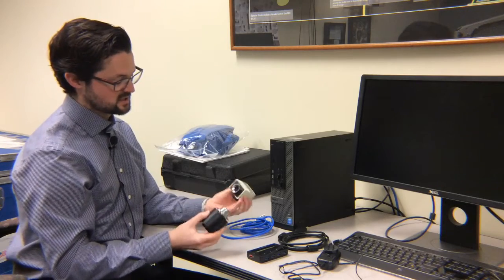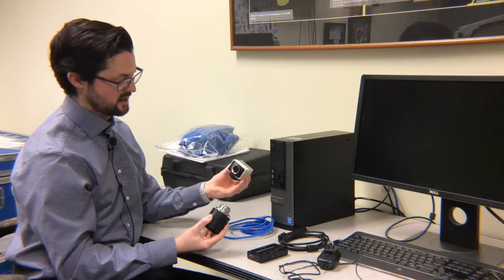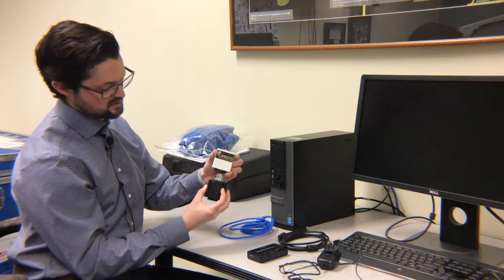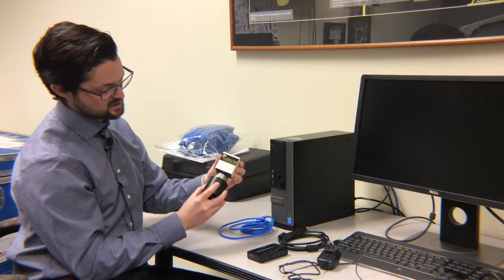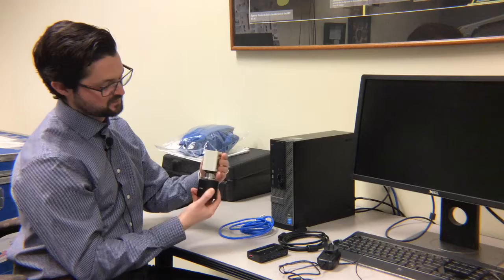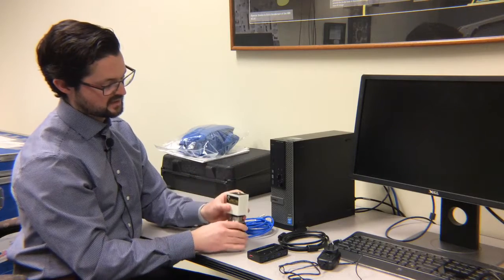Well, first thing to do is just attach your C-mount adapter to your camera. I recommend attaching it this way. It's just a simple threaded mount, screws in. Okay, that's good.